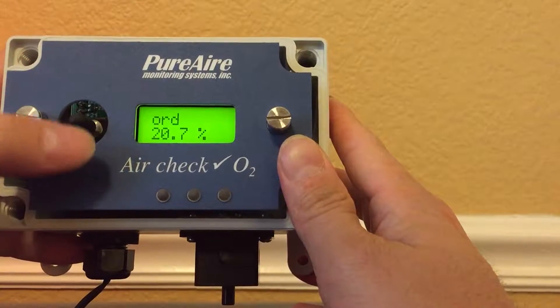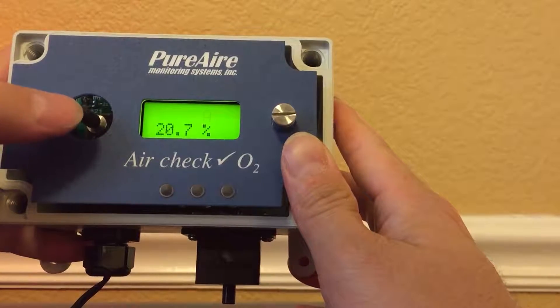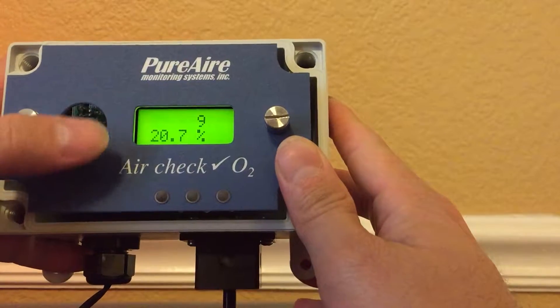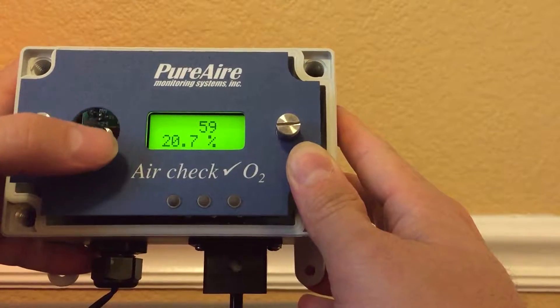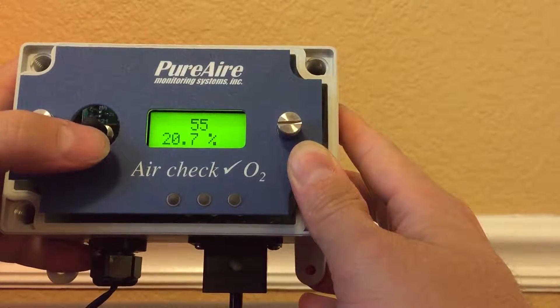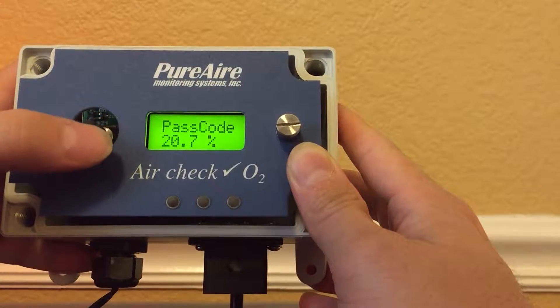We have a joystick that goes up, down, left, and right. Going right, we're going to look for the numerical value of five-five-seven, which is the passcode. I'm going up until I find five, cursor it over to the next value five, cursor it over again, and there's seven.